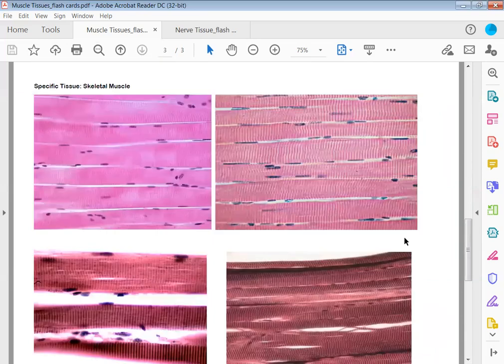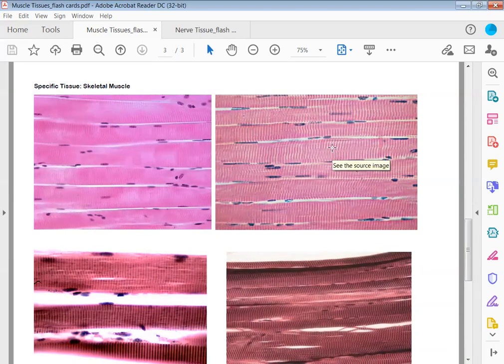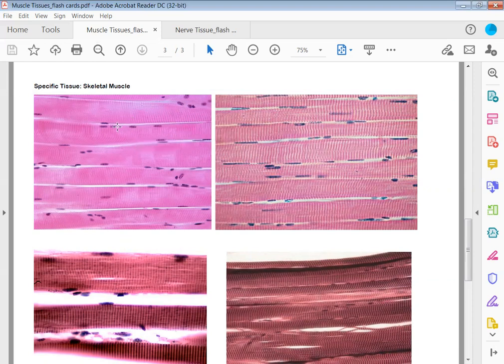The next tissue has really thick, bold fibers with a much darker tiger striping or banded look. This immediately tells you it's skeletal muscle. You're looking for those really large, thick fibers that have darker tiger striping or striations. The striations are the tiger stripes, and the dark structures are your nuclei. The big tissue category is muscle tissue, and the specific tissue is skeletal muscle.